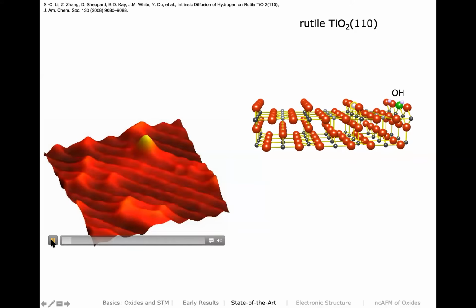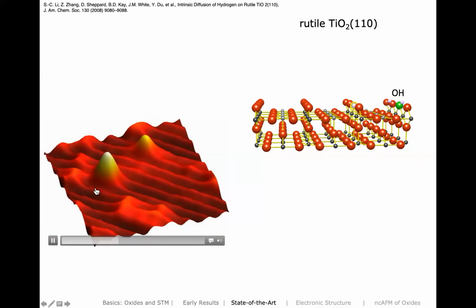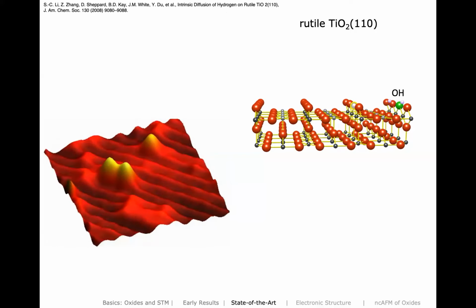So I'll play you this movie. You can see here is the water molecule coming, dissociating immediately, and then it's driven apart. Later it turned out this was because of the presence of water. When I show this movie, which is now more than 10 years old, people always ask me, how quickly can you scan? This was really slow, right? I think it took Xiaochun like 2 or 3 hours, frame after frame, every frame 2 or 3 minutes.